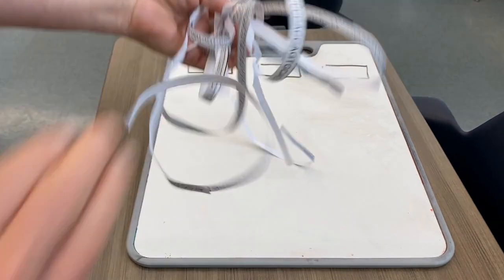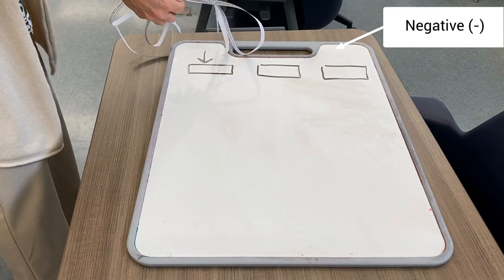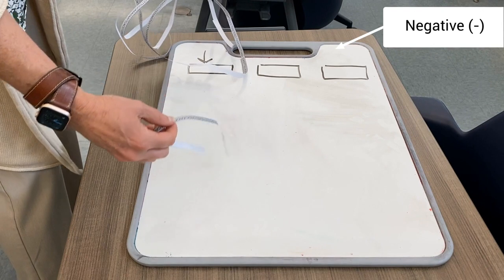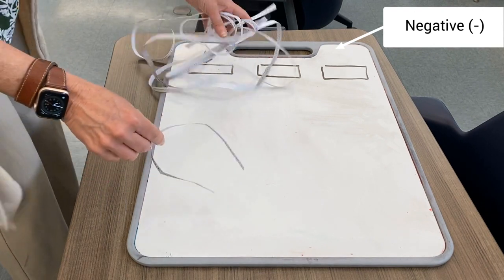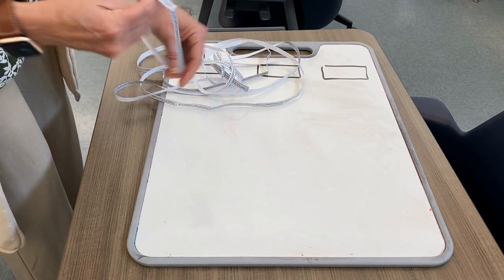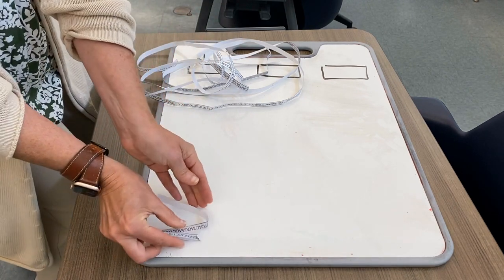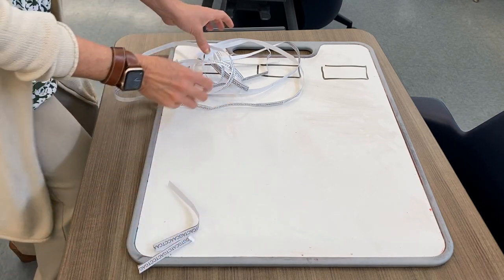So again, we have three different size DNA chunks because the restriction enzyme was able to cut at least one of them. The smallest guy is going to be able to move across the gel the furthest. So the smallest fragment of DNA has the least number of base pairs and can travel the furthest.